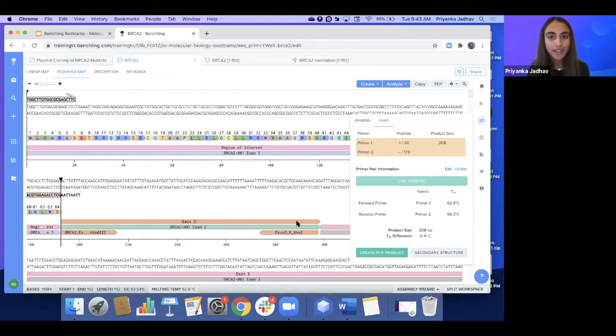Okay, I'm going to go ahead and end the poll now and share the results with everybody. So actually it looks great. Seems like the majority of everybody that voted actually mentions a Benchling sequence. But for individuals that currently download a sequence file and attach it to your notes, or copy and paste the URL or entire sequence as text, you probably know that that can really clutter up your workspace, as well as take up extra data and storage on your laptop or whatever file you're using.